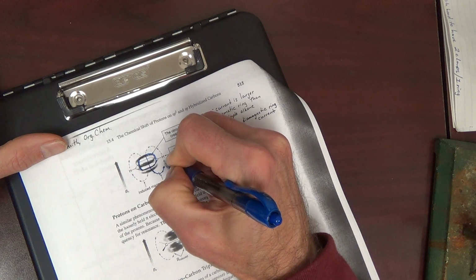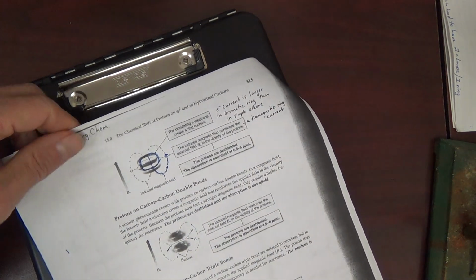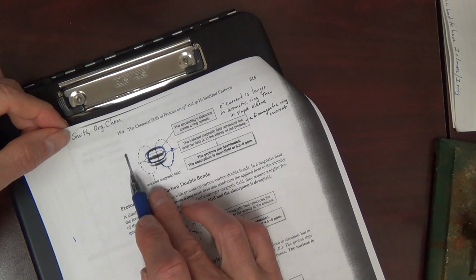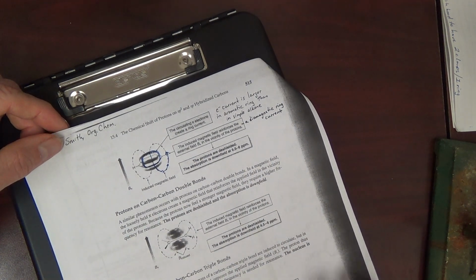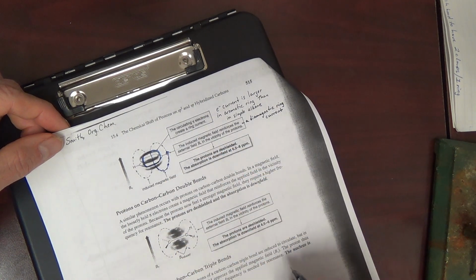But out here where the H sits, this induced magnetic field is coming this way, and it's actually lining up with the B naught. All right? And so it reinforces the external field. And that is actually not a shielding effect. It's actually a de-shielding effect.